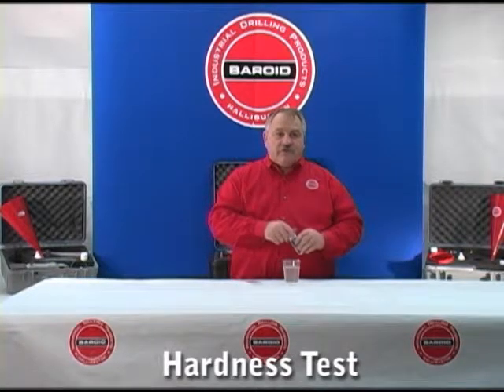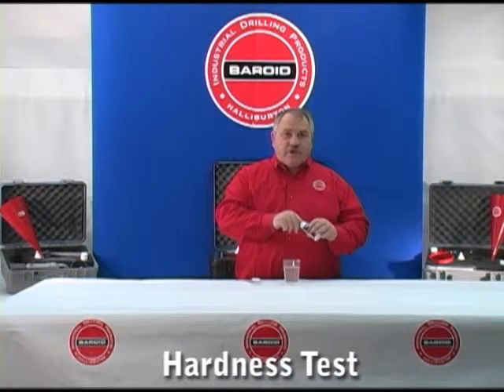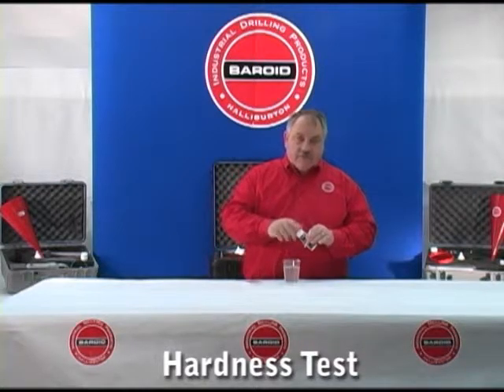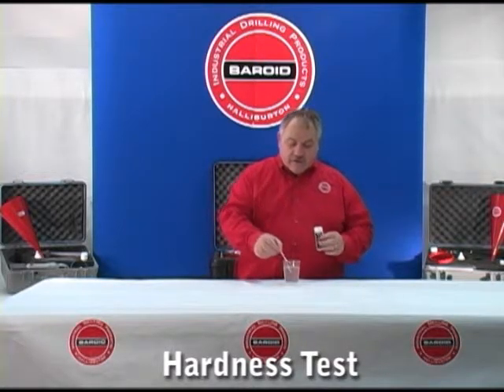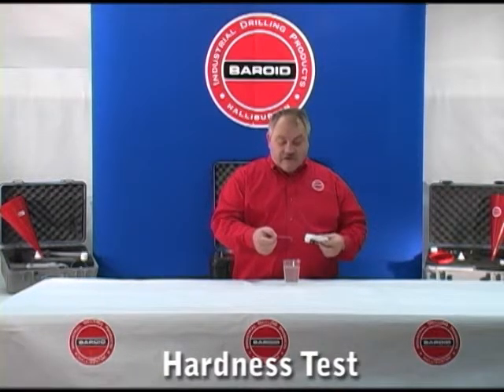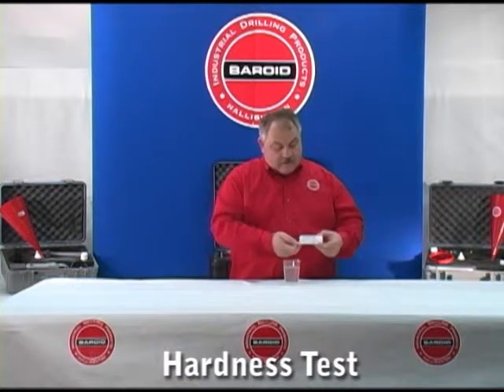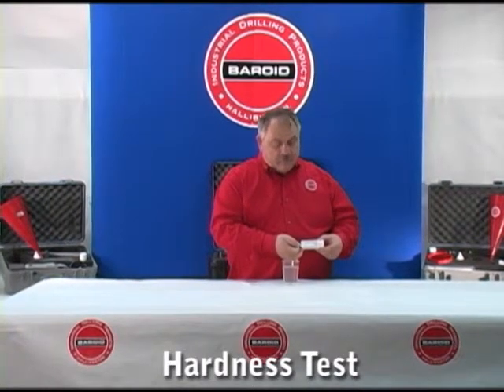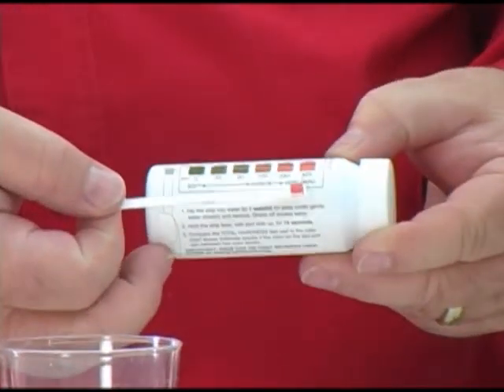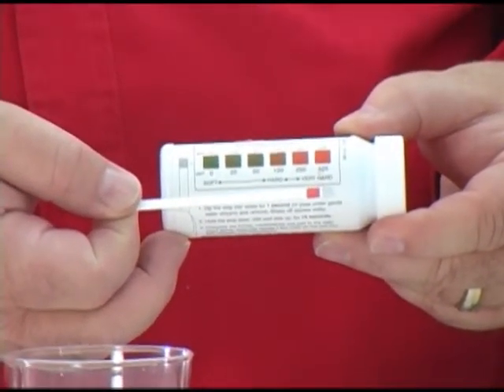So let's check the hardness of this fluid. In its simplest form it can be done with a calcium hardness test strip. Simple to use — dip the strip in your water. By the directions on the container it takes about 15 seconds for the reaction to take place, and then compare the color of the strip with the color on the bottle. This hardness is approximately 425 milligrams per liter.